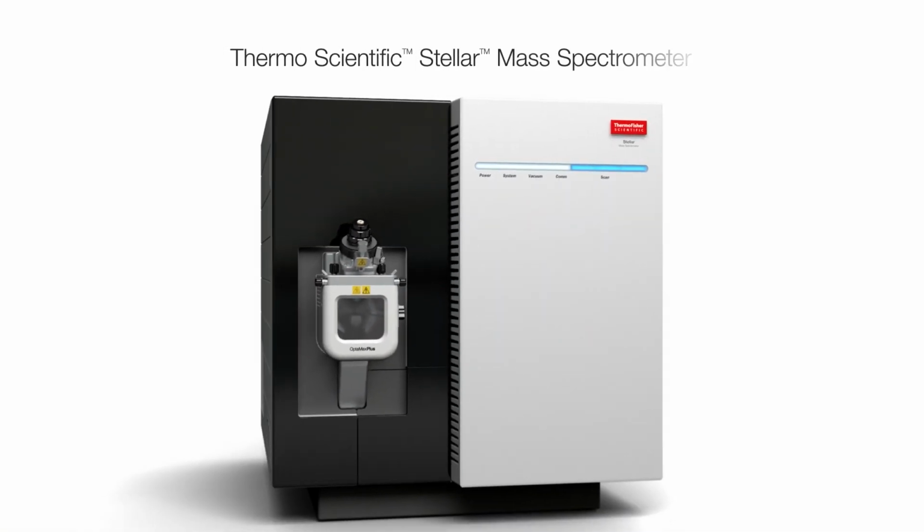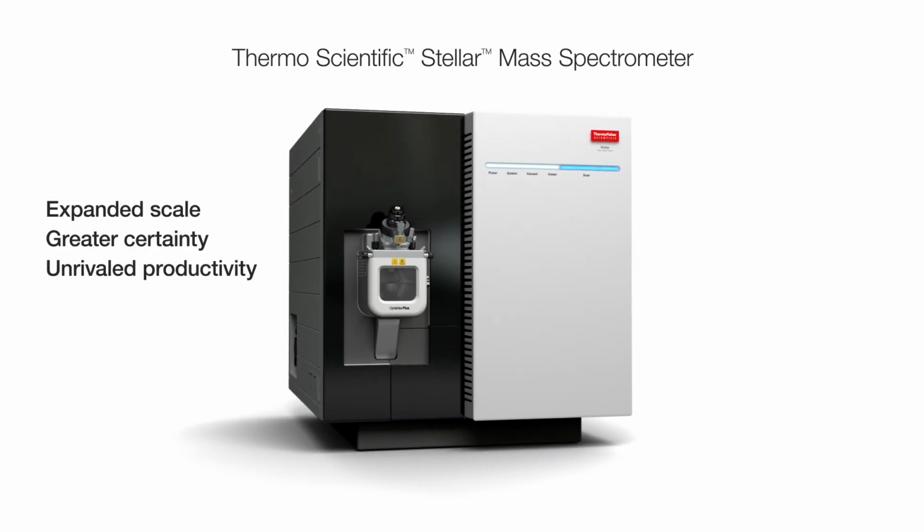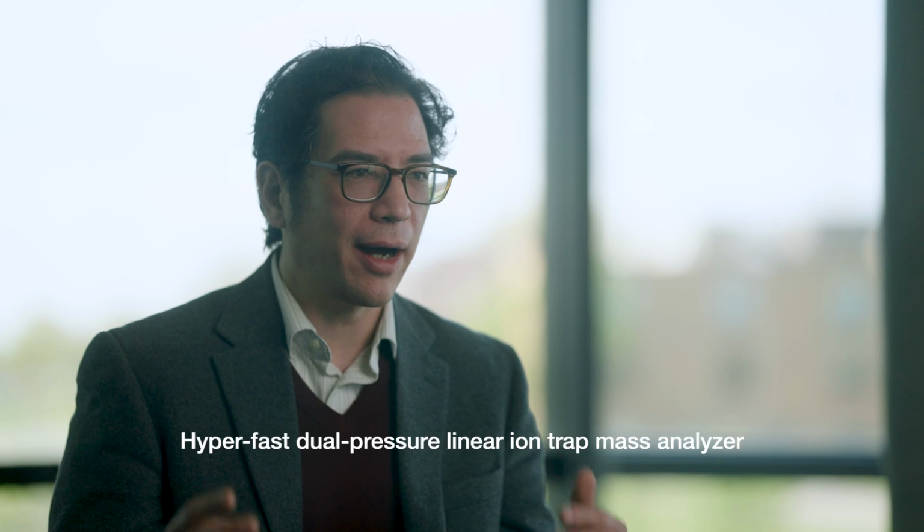And we were surprised by how good quality libraries we could actually generate using just the ion trap on its own. The advantage of trying to do a data independent acquisition based library is that we can also do it without additional chemical fractionation.